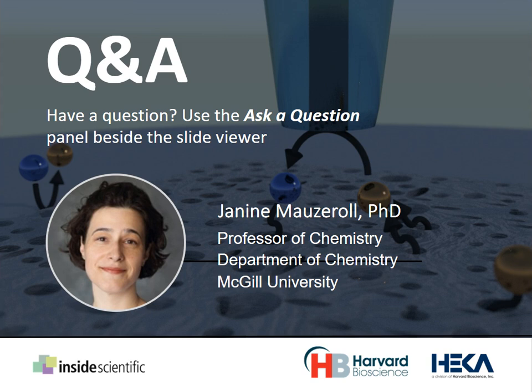Yes, etching surfaces and seeing whether or not the etched surface, or in some cases, in microfabrication you also have copper deposition. SECM has been used in this field. There are a few papers that I'm aware of, and in the Q&A answers that I'll do tomorrow I can provide some reference ideas, but definitely it's possible to use it.